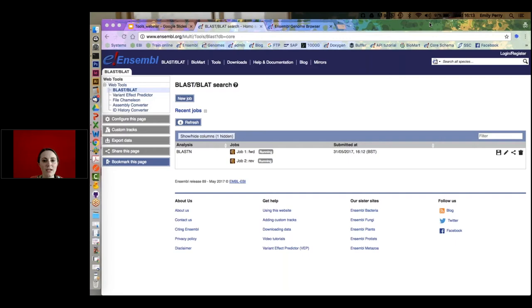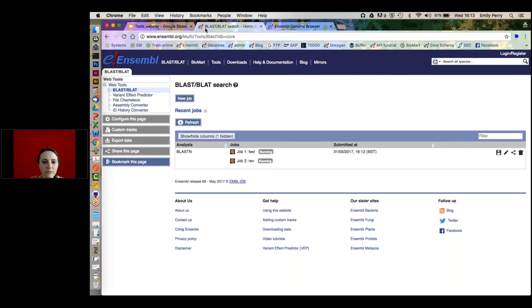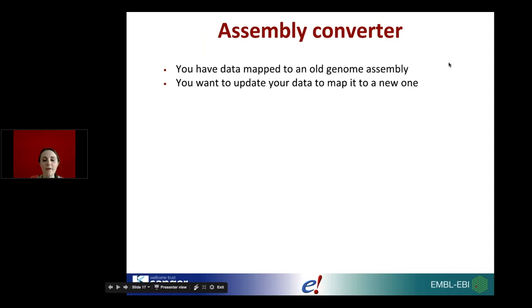I'll jump back to this and take a look at the BLAST results after we've talked about our next section. BLAST is a very common tool found on lots of different databases.